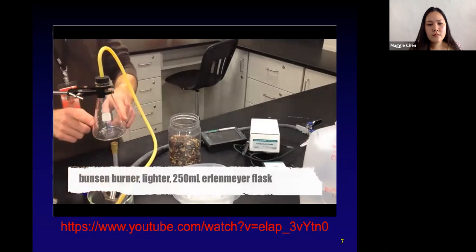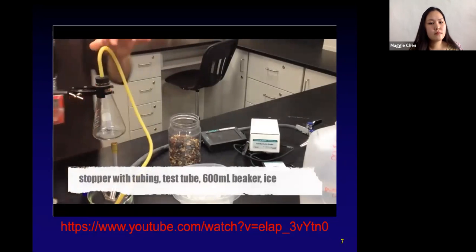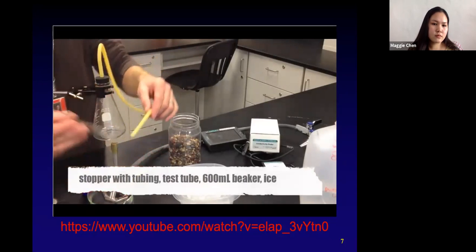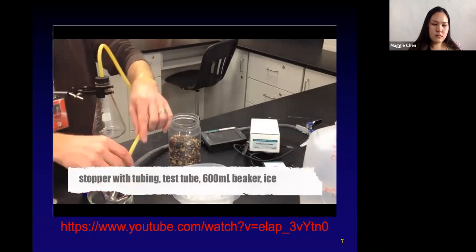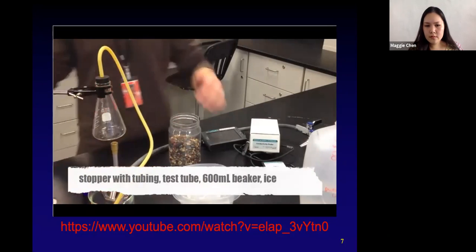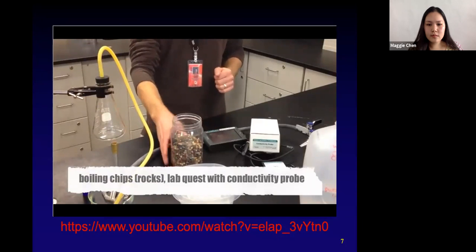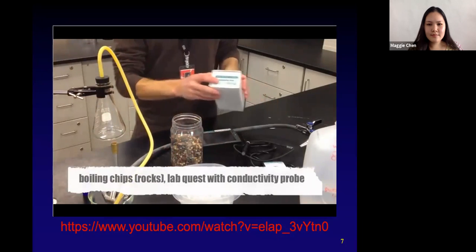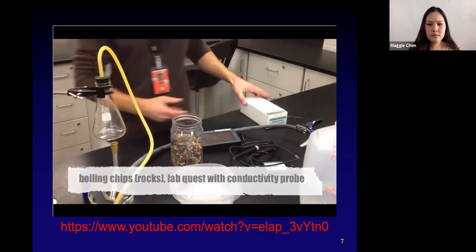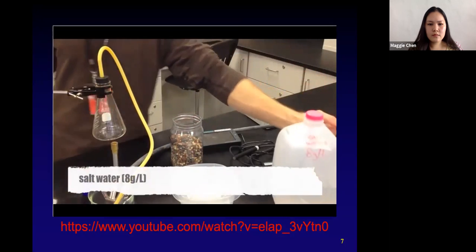You'll need a 250 milliliter Erlenmeyer flask with a rubber stopper and a tube coming out of it that's going to collect the steam, and you're going to need a test tube in order to condense the steam into liquid water. You'll need a 600 milliliter beaker, some ice, a couple boiling chips or rocks, a LabQuest device, and a conductivity probe to measure how much salt is in the water. And of course you'll need salt water in order to run this experiment as well.